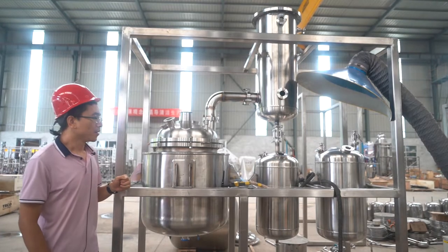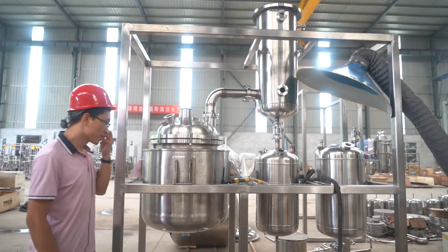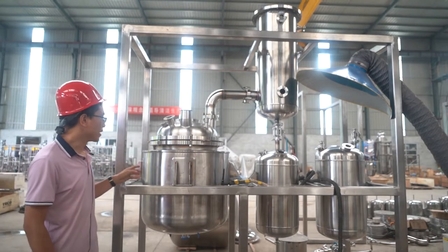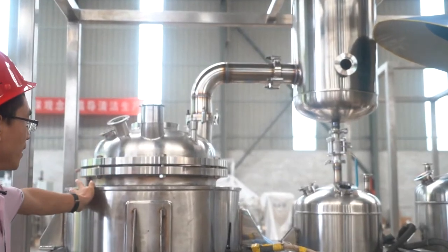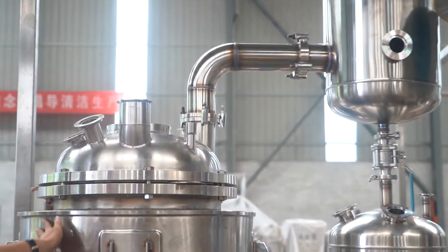Hello, this is our new design recirculation filter reactor. Now we are producing it in our factory. This one is a 100-liter reactor.